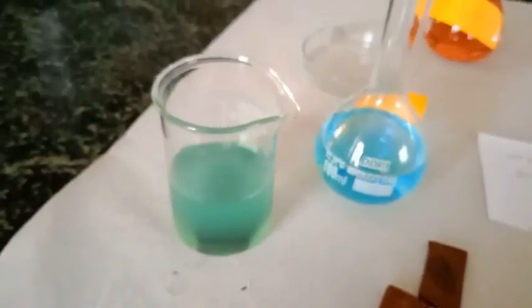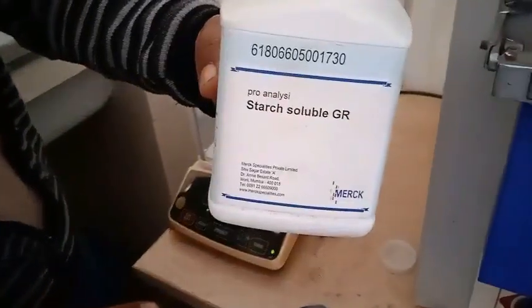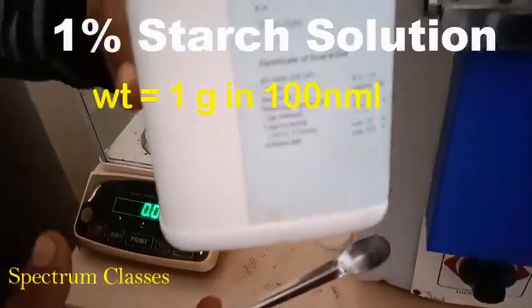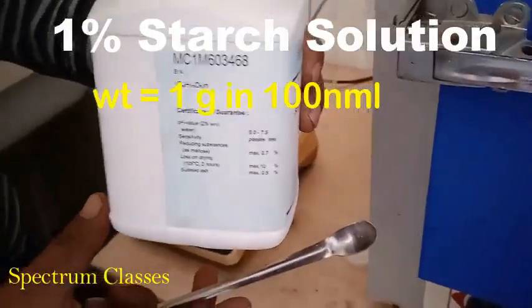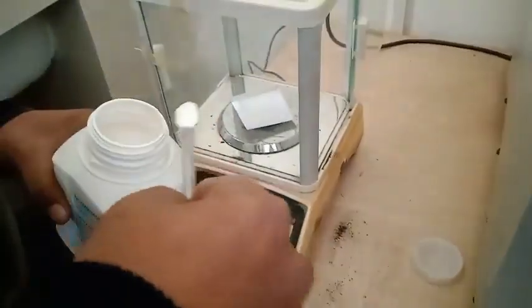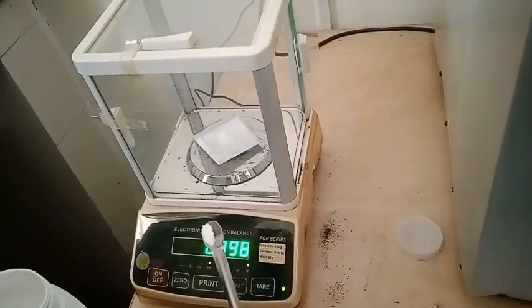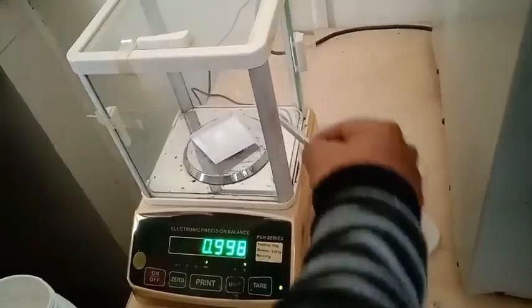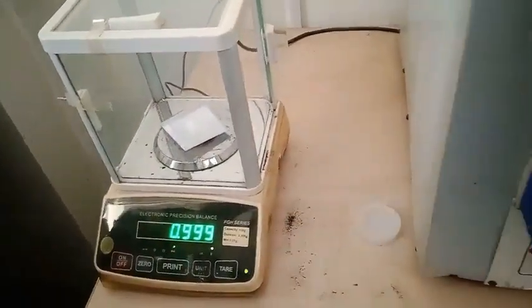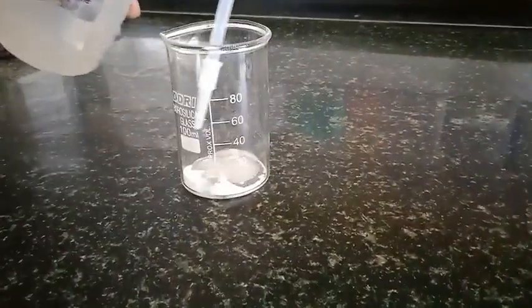Now starch solution also needs to be prepared freshly. So I am going to prepare starch solution, for which I am going to take 1 gram of starch and dissolve it in 100 ml. To prepare starch solution, first you dissolve it in some cold water and then pour this slurry into boiling water.